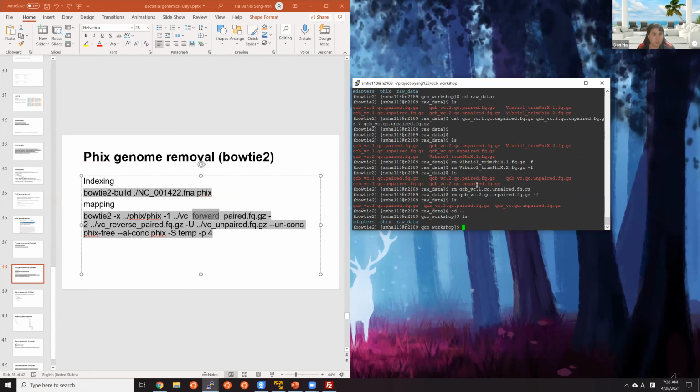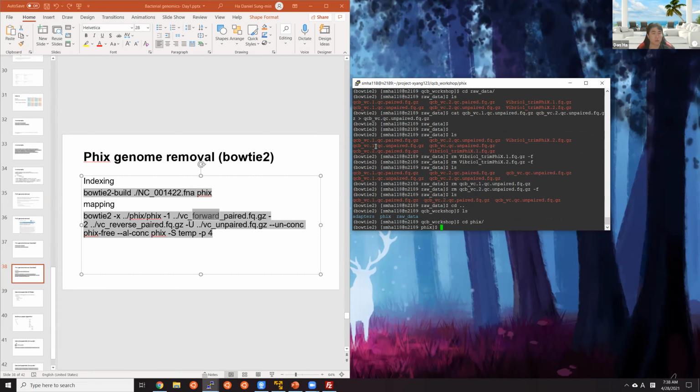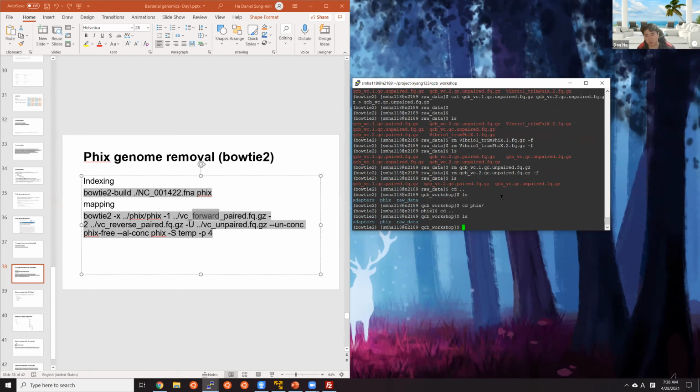So let's go back to the PhiX directory, and actually let's go up to the QCB workshop directory.